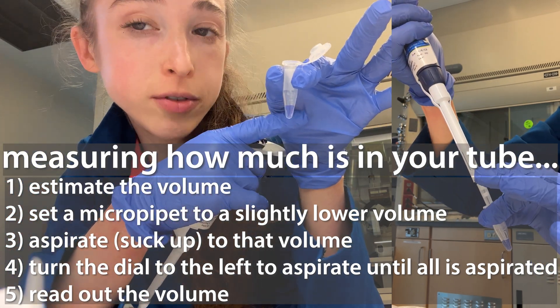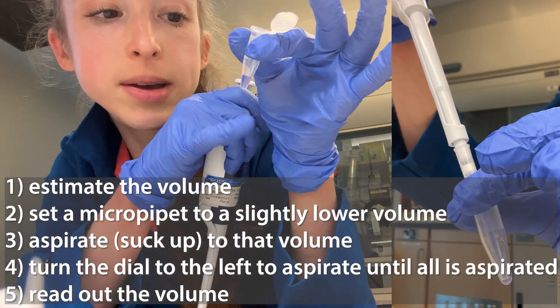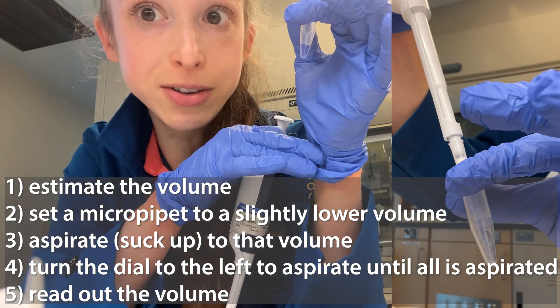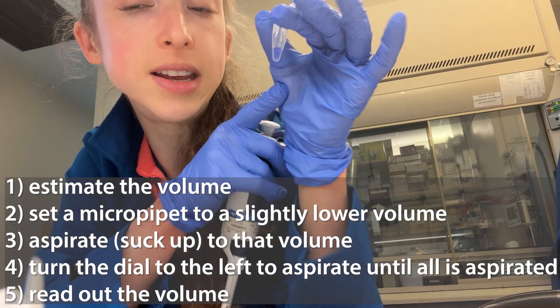If you want to measure the amount of liquid in an Eppendorf tube, you can do this with a micropipette. Start by estimating how much liquid is in the tube based on the approximation lines, or how much you think should be in there based on your calculations. First, give it a quick spin so all the liquid collects to the bottom and you're not sucking up any air.